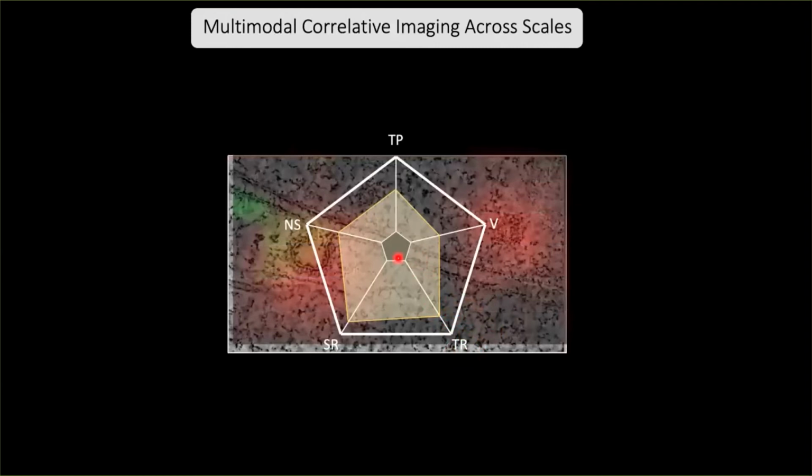It also is not the lowest, because we still get some temporal information from using different combinations of fluorescent markers, so we know this is very likely an earlier object than this. Spatial resolution can get slightly higher by using even more advanced electron microscopy approaches. So I would place it here.